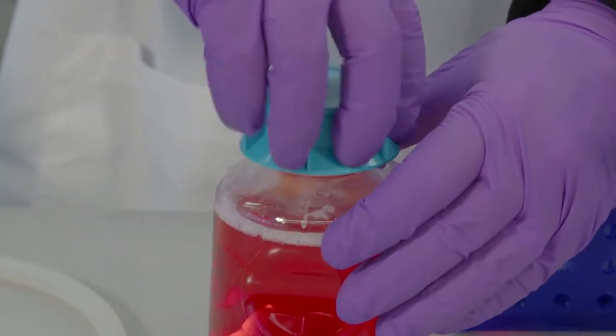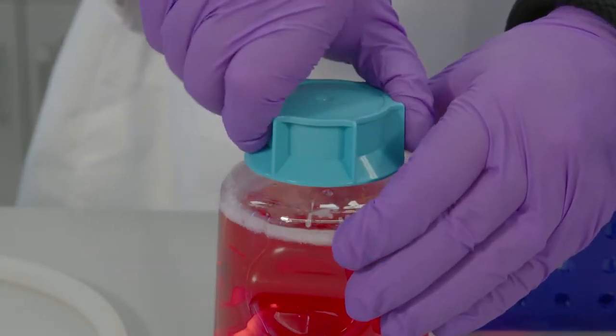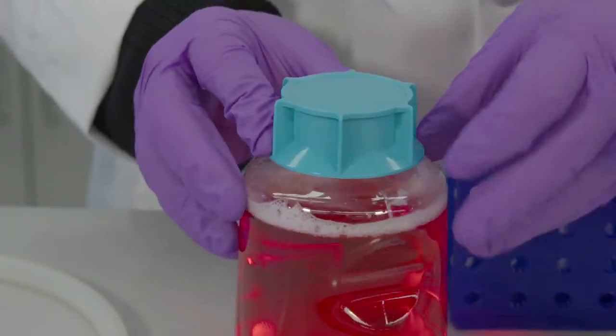For the SteriCup E system, screw the cap onto the receiver bottle until it clicks into a sealed position.